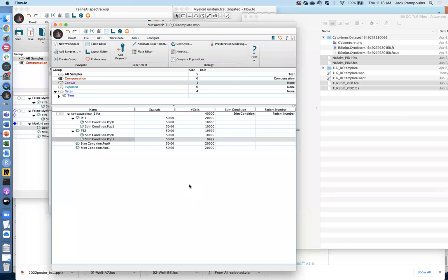It's just that you're saying, okay, this half of the tumor I'm going to use as the reference control, and then I'm going to treat the other half of the tumor as the quote unquote sample. The point is that the algorithm just needs to know, okay, when I'm looking at what you are saying is a control, it has, let's say 5 peaks across 2 different channels.